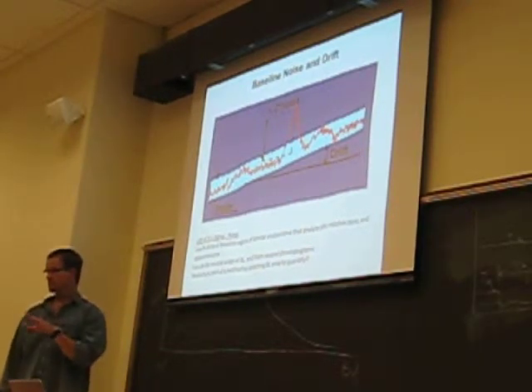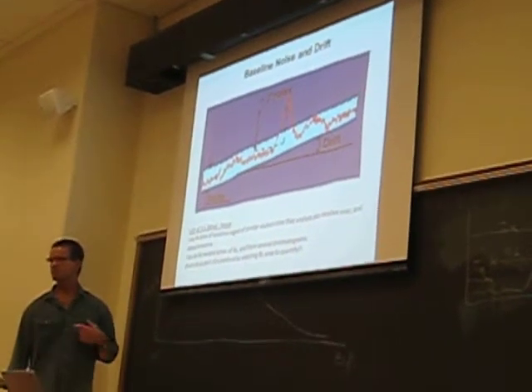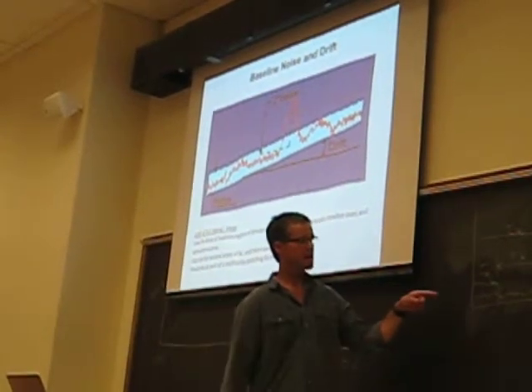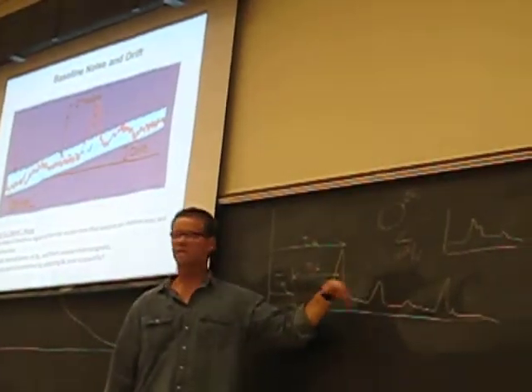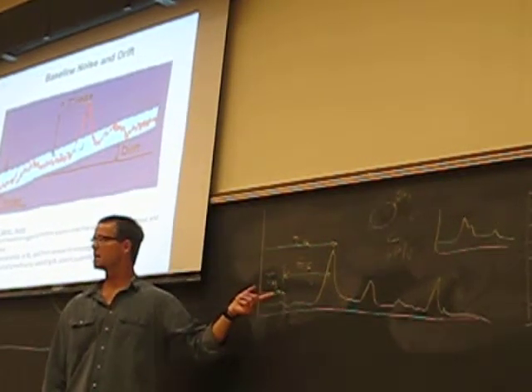Have you guys done this yet? Okay, so you need to do it, right? So you say, how do I do this? Well, you would say, here's my chromatogram. I get chloride and this and that, and all these things come out. And now I want to know what my baseline noise is.